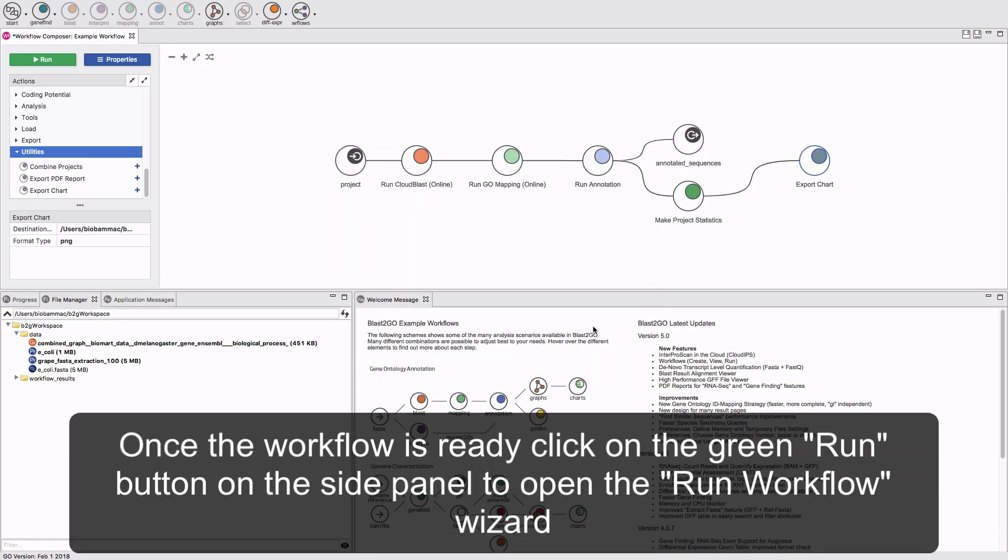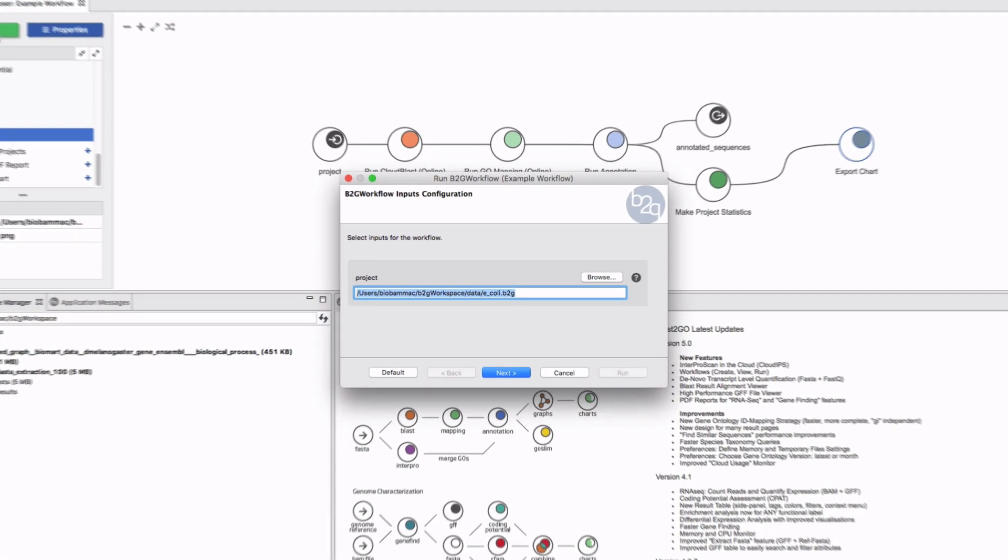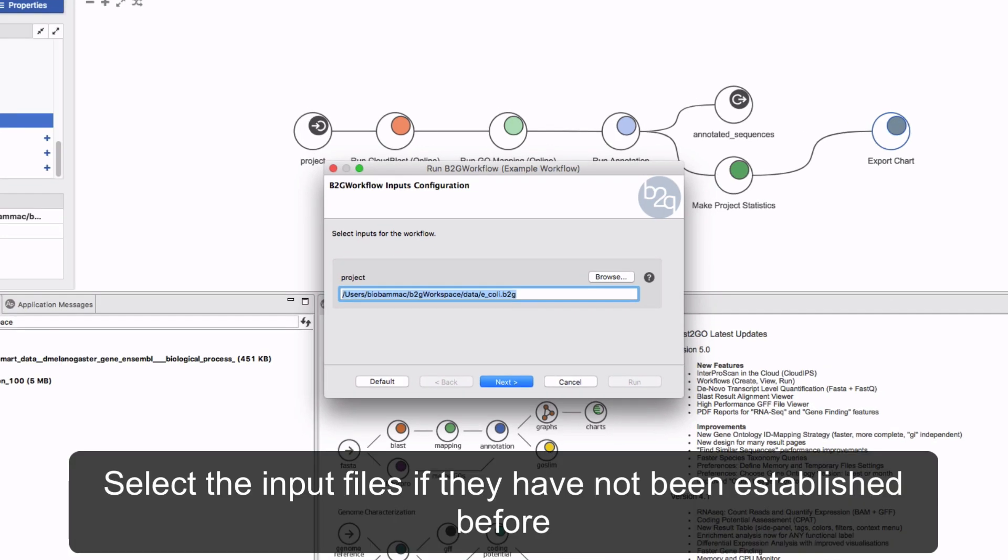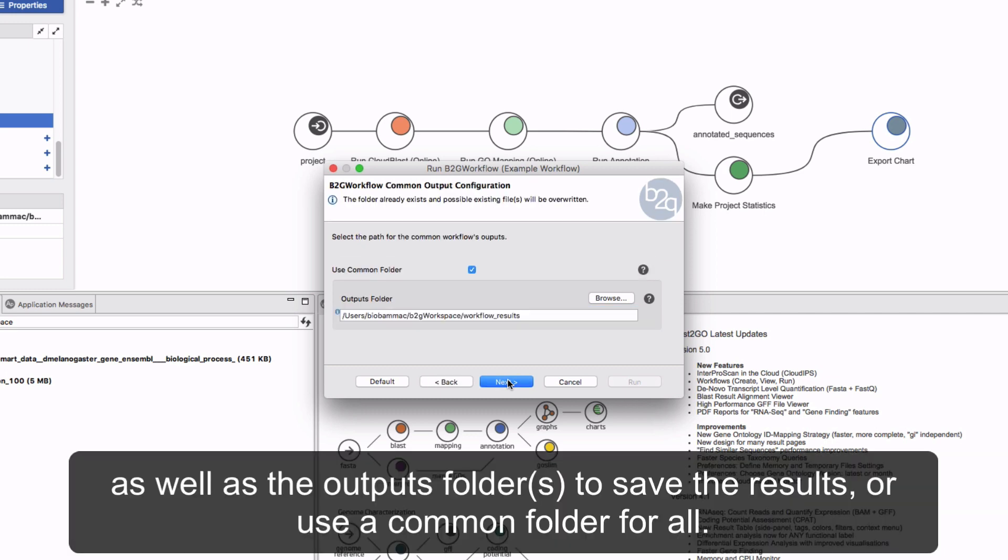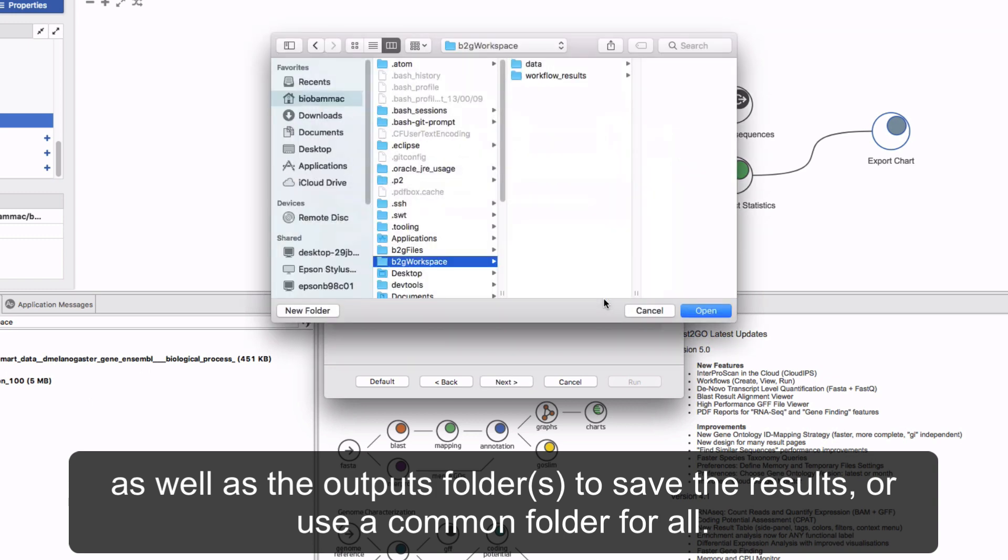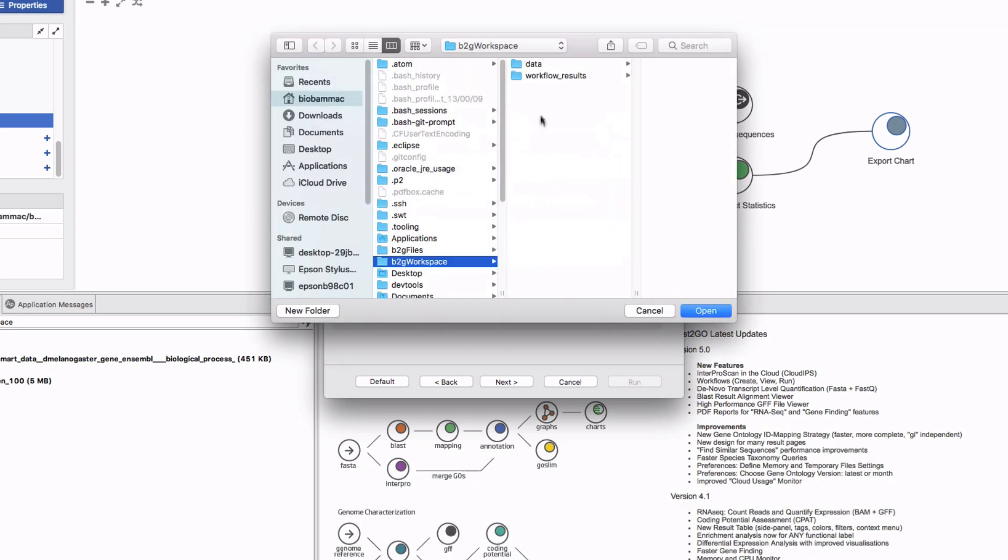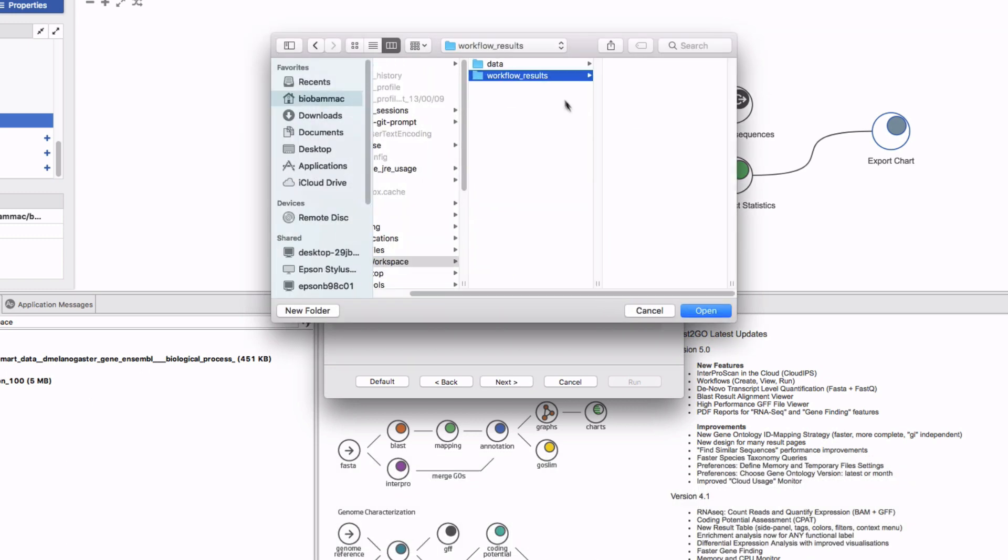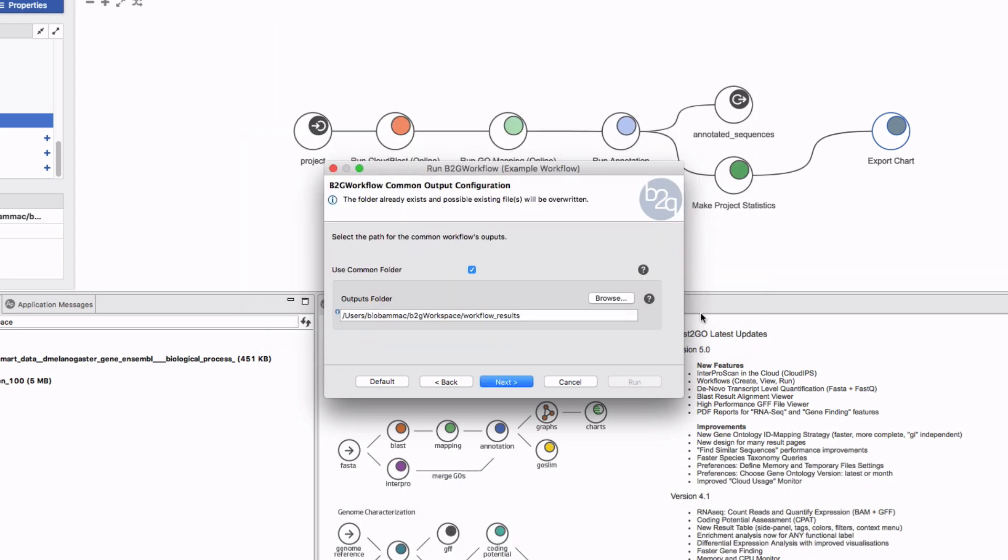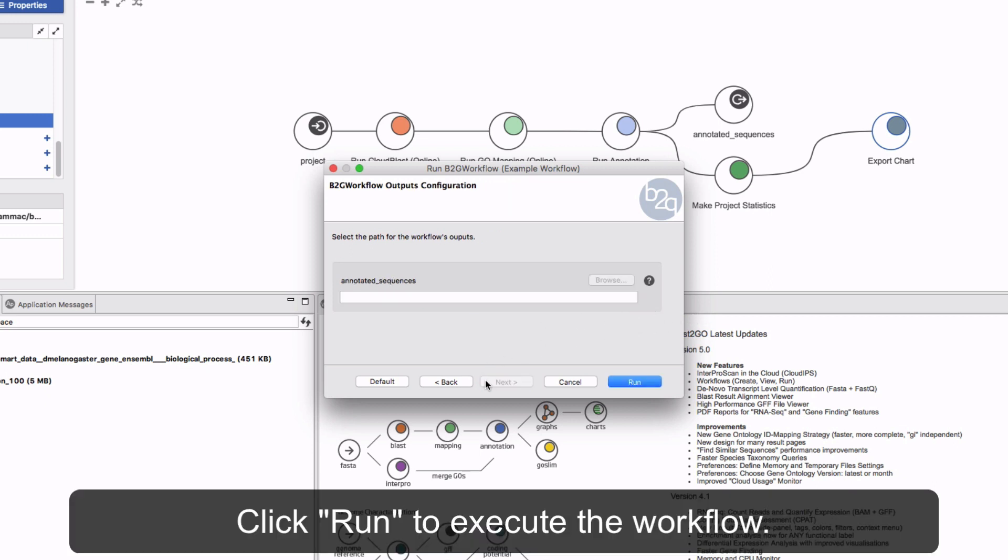Once the workflow is ready, click on the green Run button on the side panel to open the Run Workflow Wizard. Select the input files if they have not been established before, as well as the output folders to save the results or use a common folder for all. Click Run to execute the workflow.